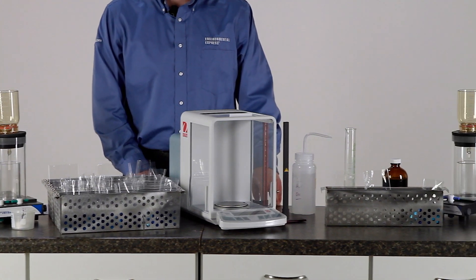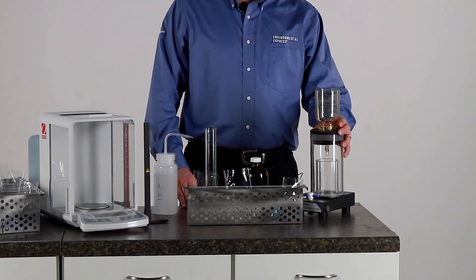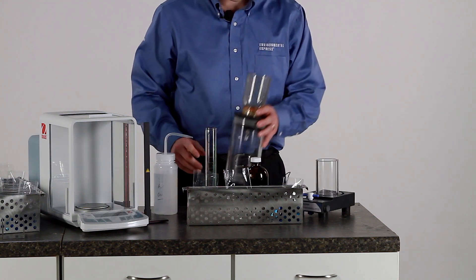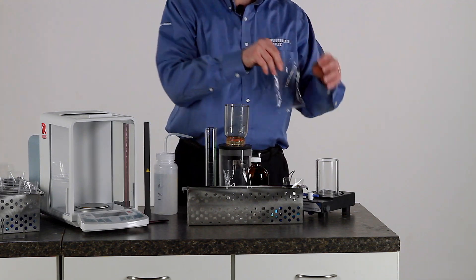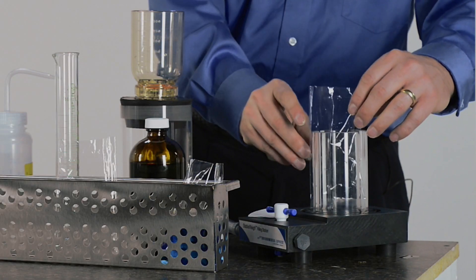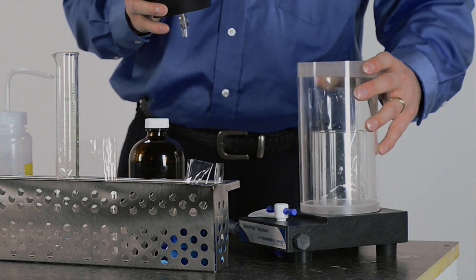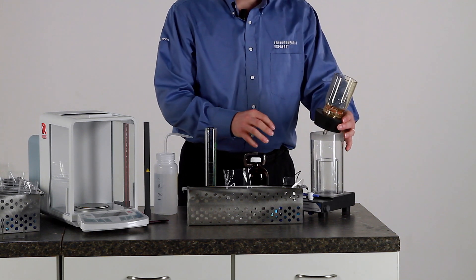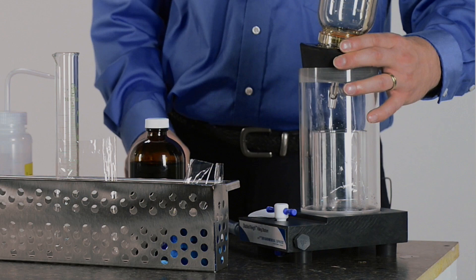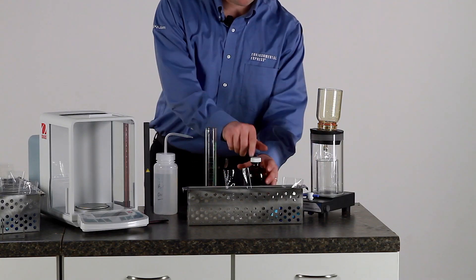To use the Environmental Express Stable Way products is very similar to the materials that you are using now. For the filling station, it will work very similar to your side arm flask. Place one Stable Way vessel inside the support holder, place the shell on the outside, and when putting the stopper and the filter funnel on top, make sure the tip is securely inside the vessel so that you don't spill when filtering the sample.